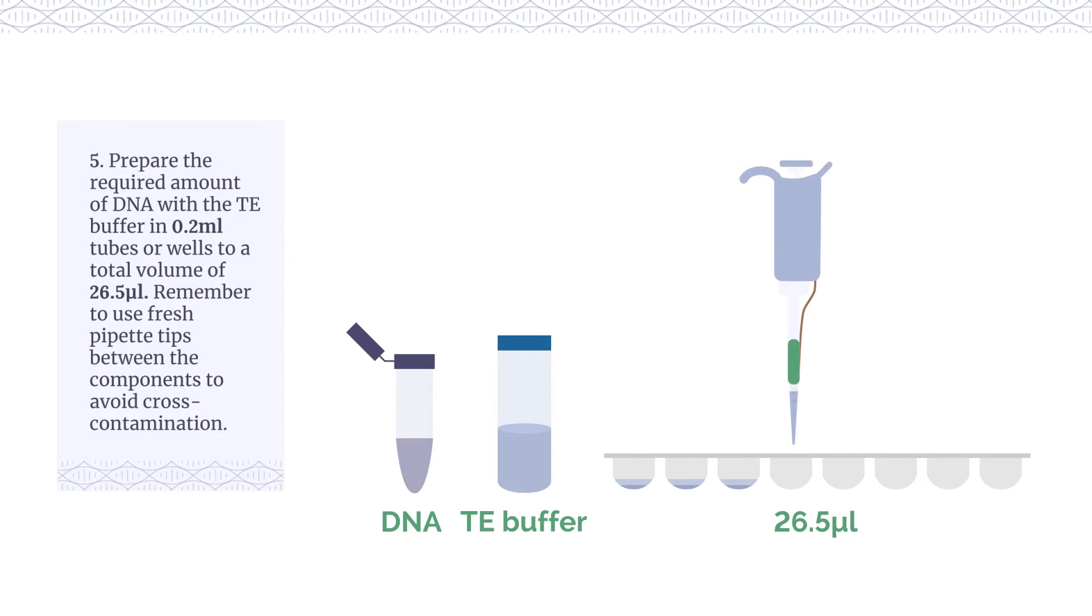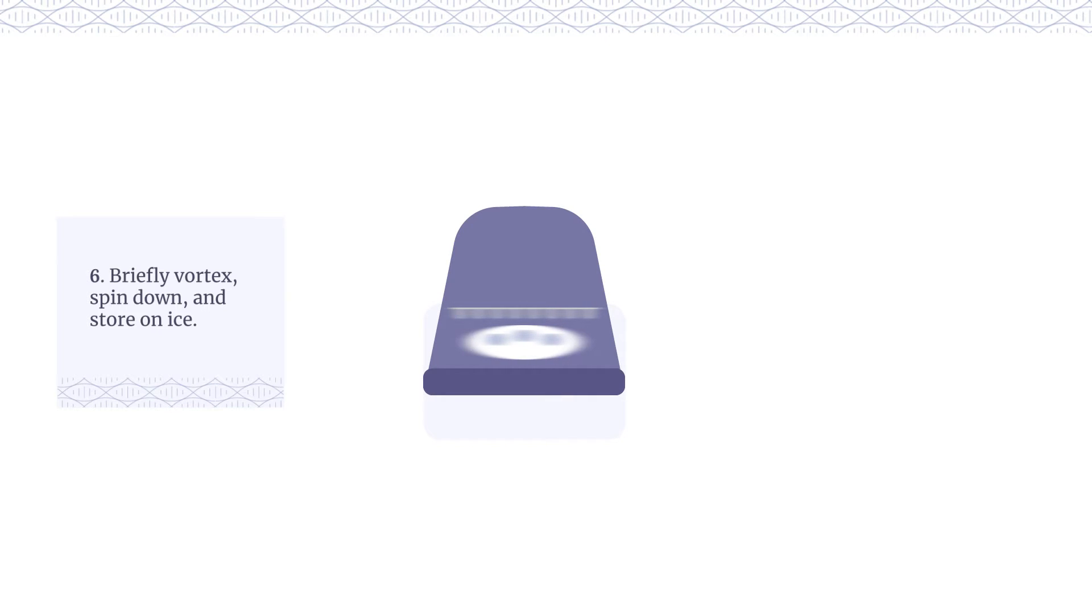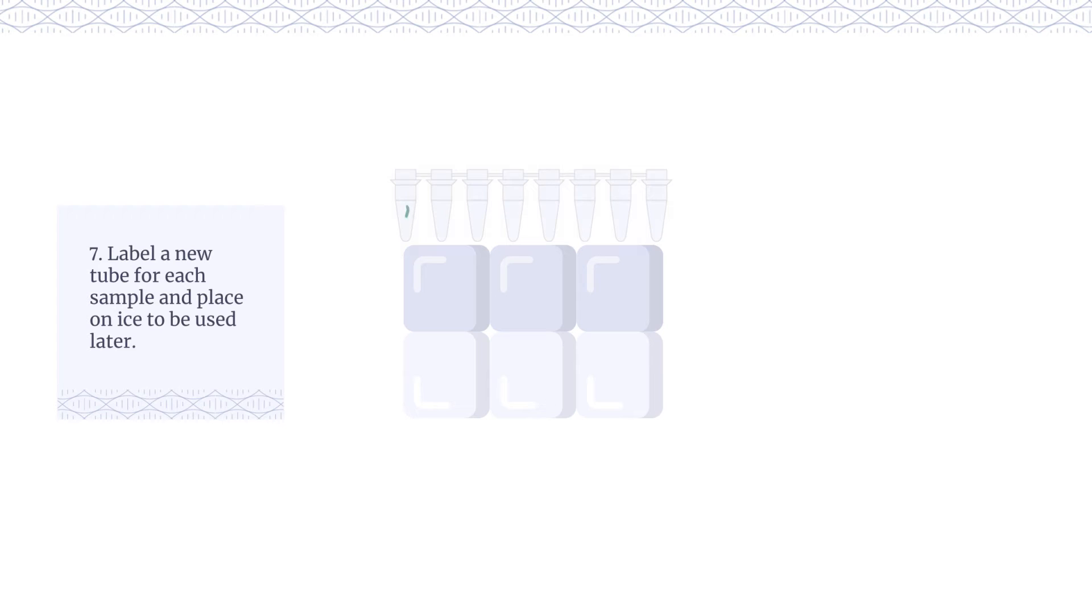Remember to use fresh pipette tips between components to avoid cross-contamination. Briefly vortex, spin down, and store on ice. Label a new tube for each sample and place on ice to be used later.